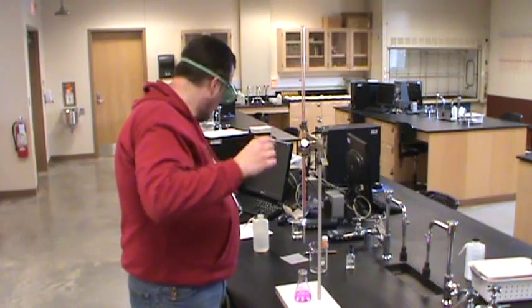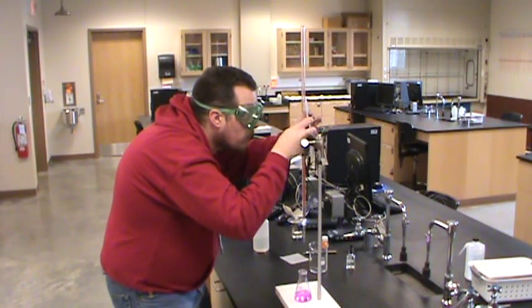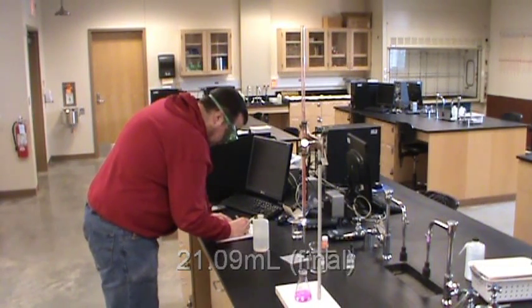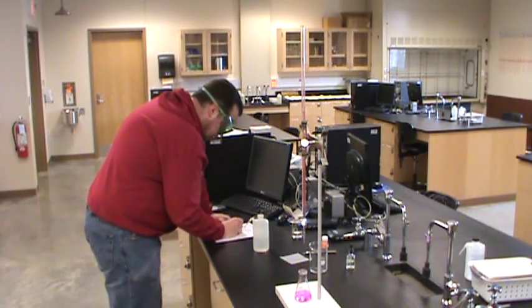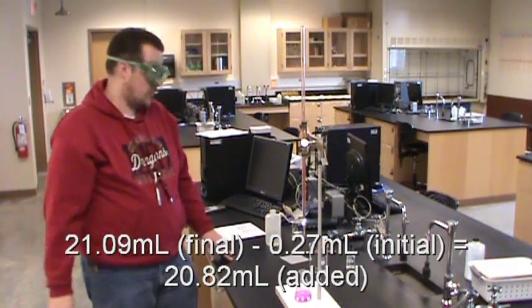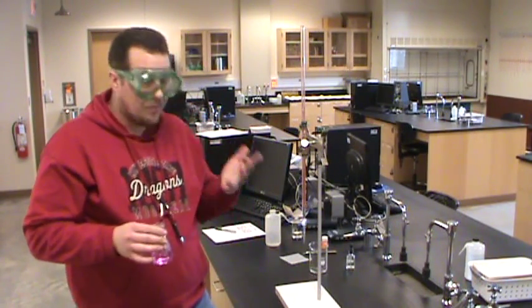So let me slide this up a little bit to make it easier to take a final reading. Looks like 21.09. So that means that I've added 20.82 milliliters of my unknown base. Well, that's the first half of the experiment. The other half of the experiment is really the same thing. Instead of KHP, you're going to be using an unknown hydrochloric acid solution, but it's just another titration.